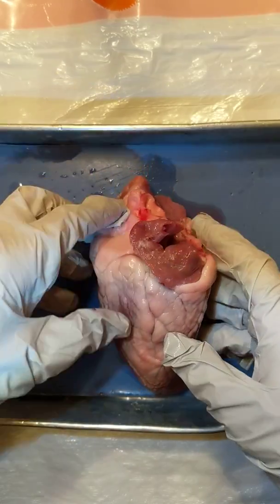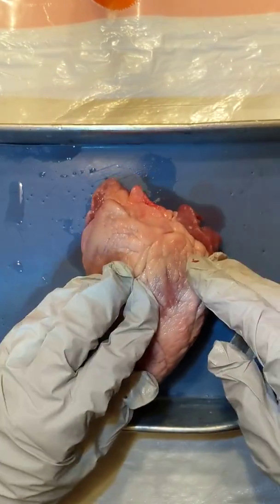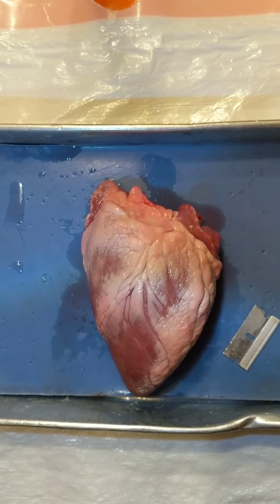Now for the next part, you can do this by the sink. I'm going to get some water and do it right here.